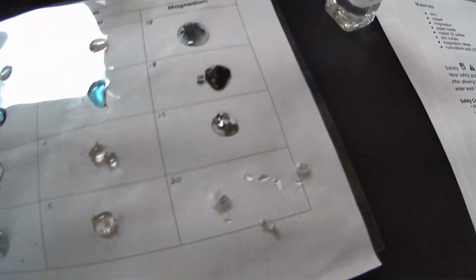And then here, again, was my magnesium and the hydrochloric acid. I'm going to do this again with a little bit more so you can see. Definitely a big violent reaction. Lots of bubbles. There's gas being produced, which I can get a kind of odor from as well. All right, so those are the reactions that I have.